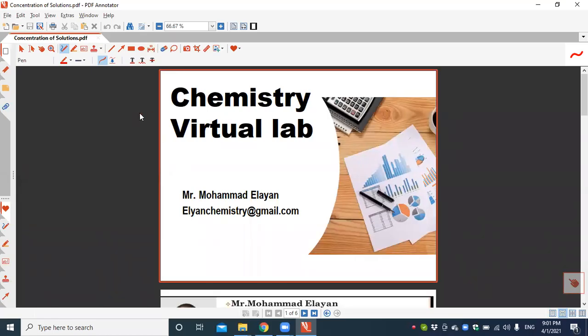Good afternoon. Today we are going to do an experiment in the virtual chemistry lab, an online lab.